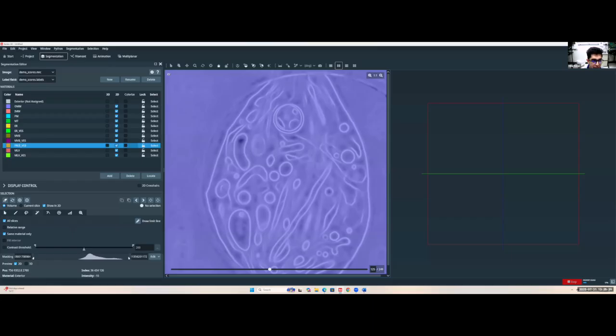Now that we've launched the magic wand and we set it up, it's time to properly segment. This masking scale is what is going to determine how you segment. Right now you can see we have these domain restrictors on the left side and the right side. You can also numerically adjust them, but it's not really worth the time. We need to adjust this mask and restrict the domain so that only the signal is covered.